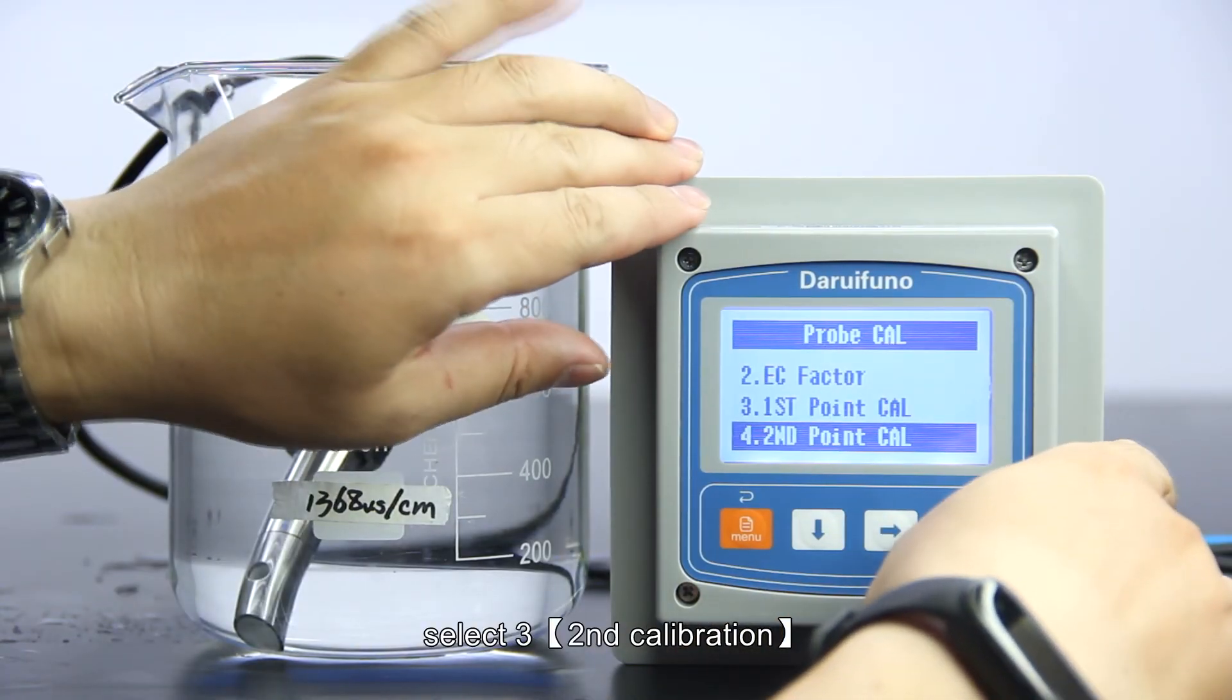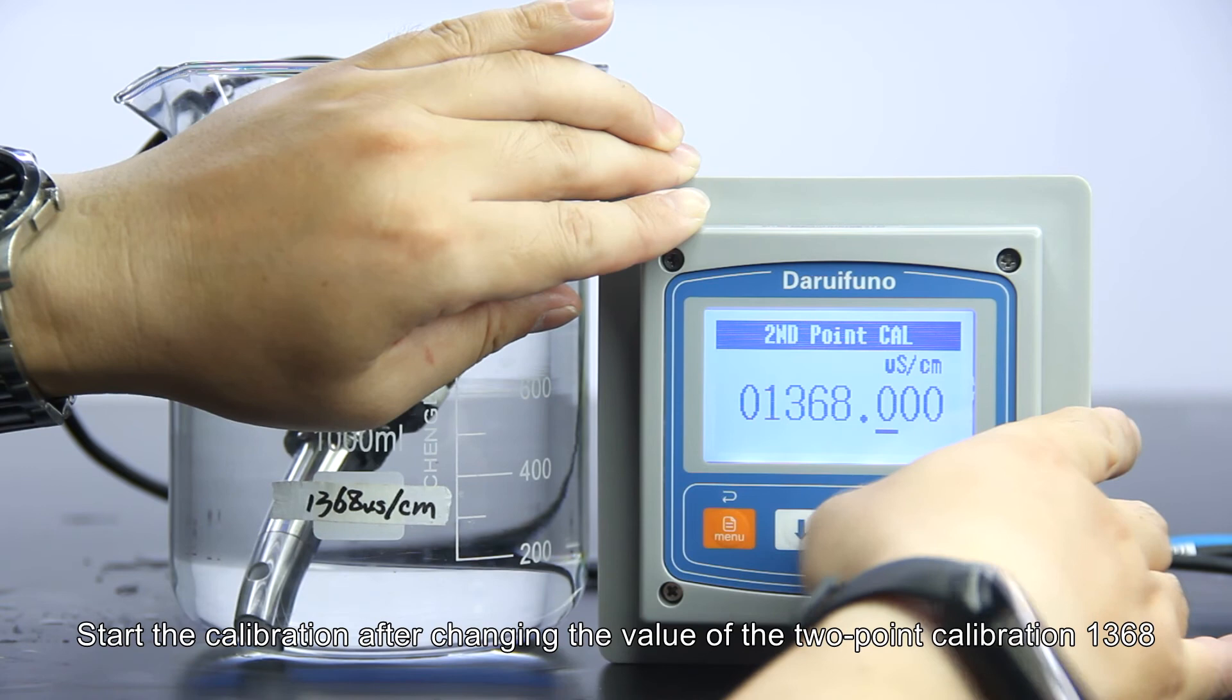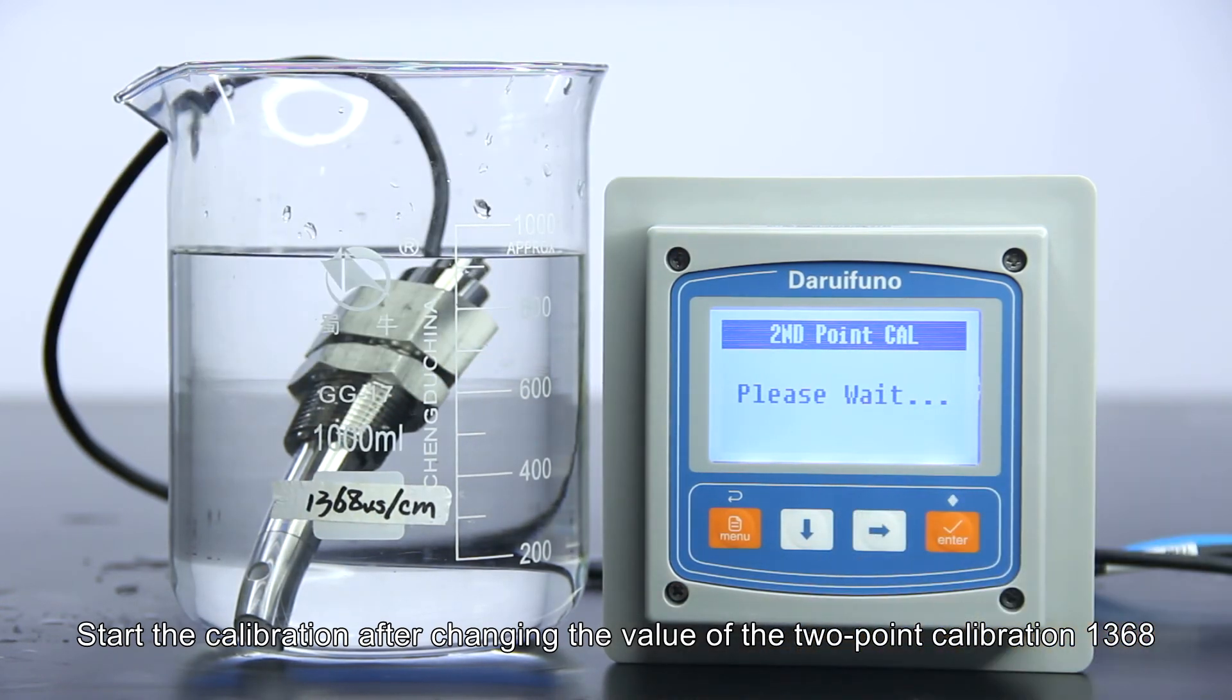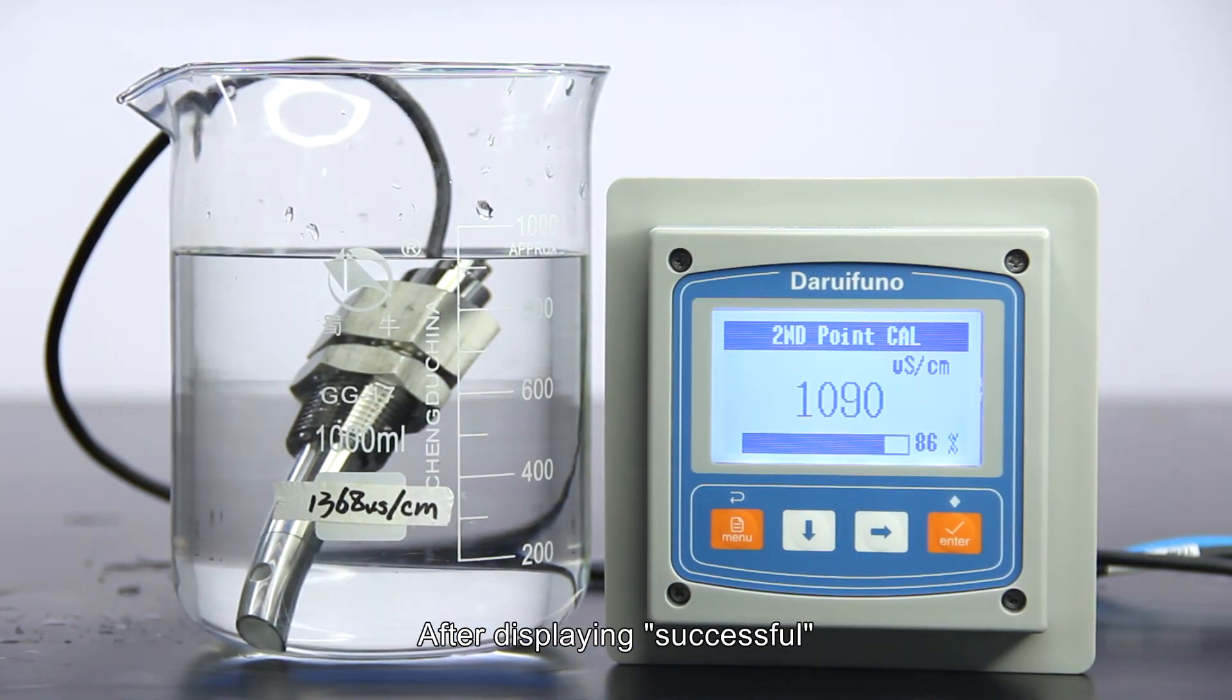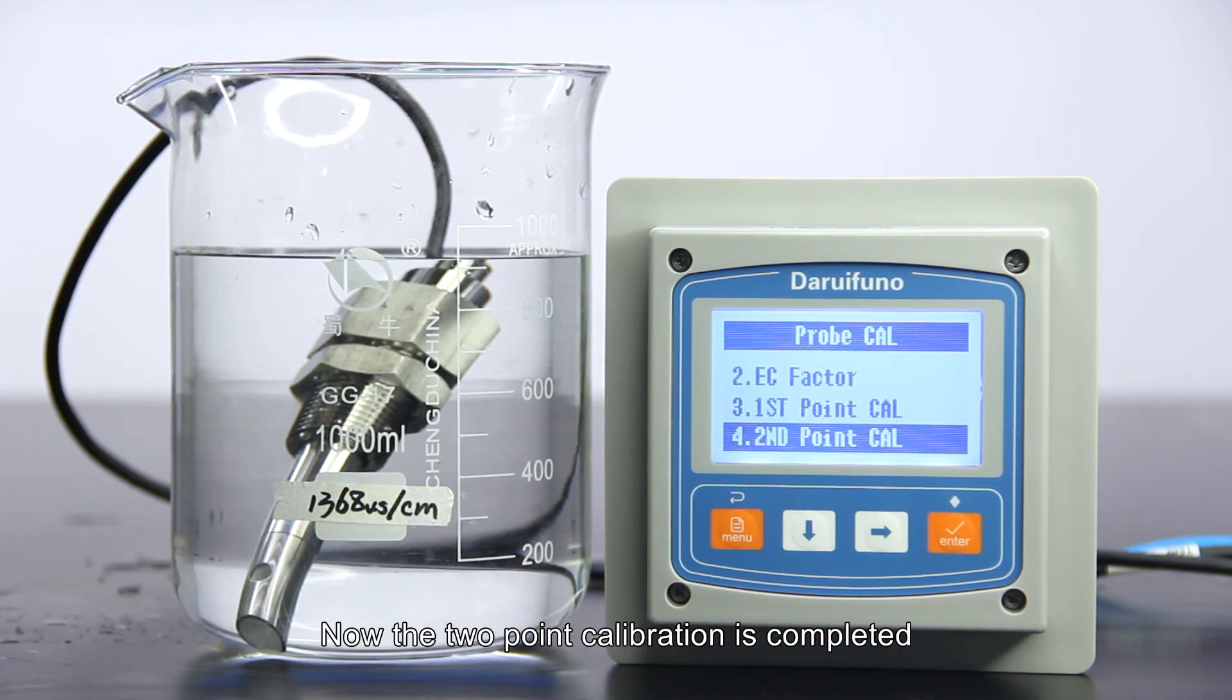Select second calibration. Start the calibration after changing the value of the 2 point calibration to 1368. After displaying successful, return to the main interface. Now the 2 point calibration is completed.